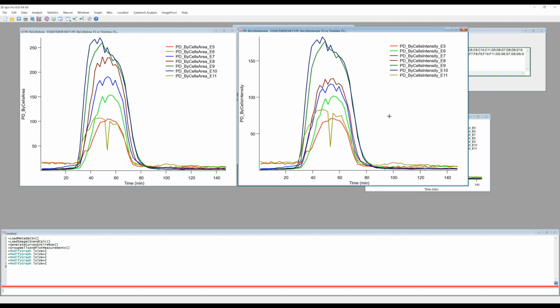So again, it would be useful to check the movies and see what is going on, see if there are any errors in those steps, or these changes are actually legitimate. Maybe there is some inherent property of the cells that displays in such way.